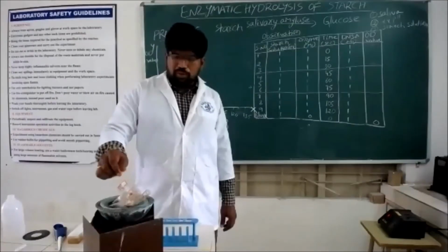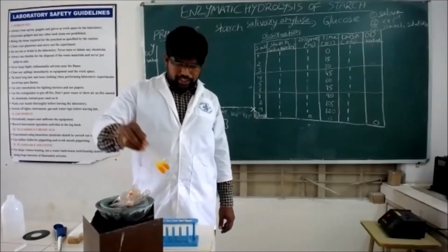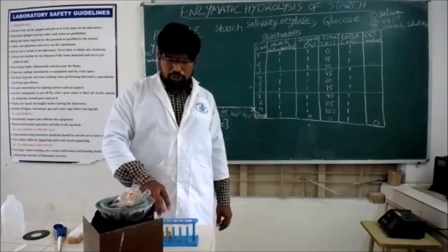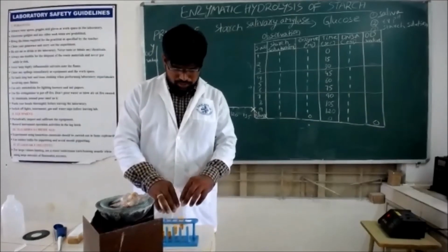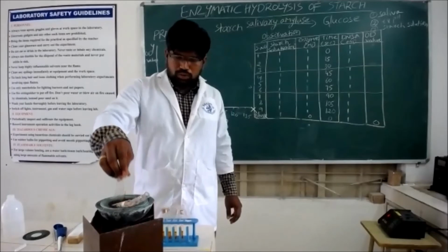After 5 minutes of boiling, bring out the test tubes from the water bath and cool the mixtures.